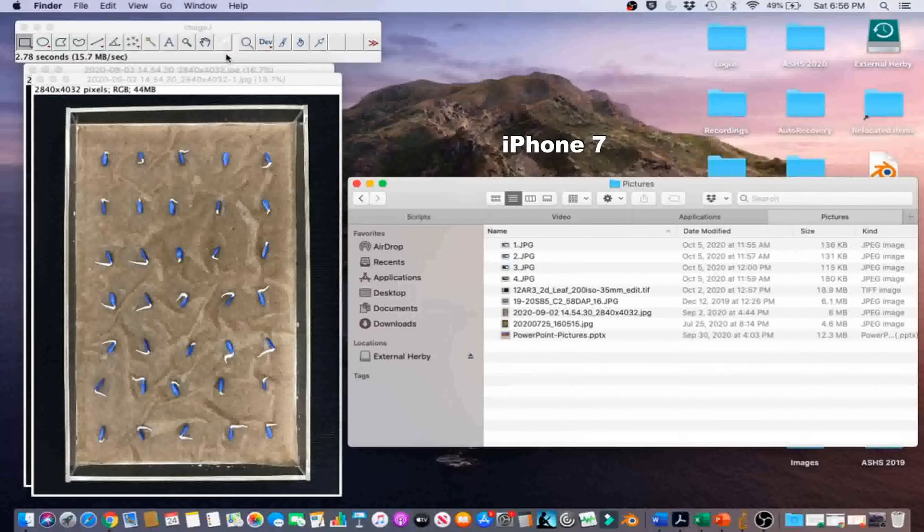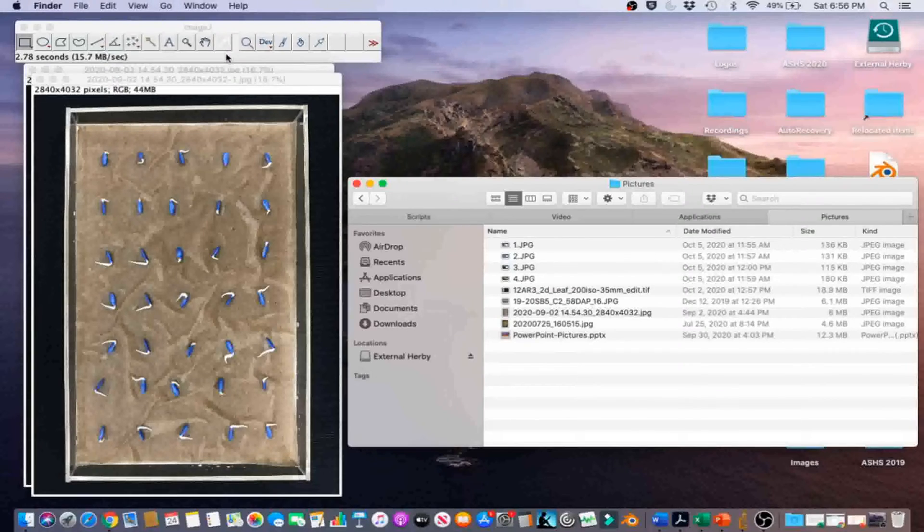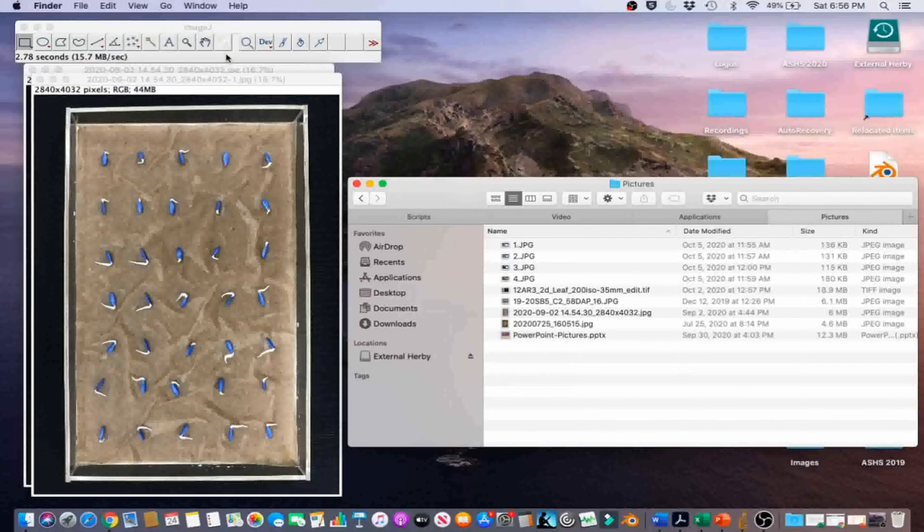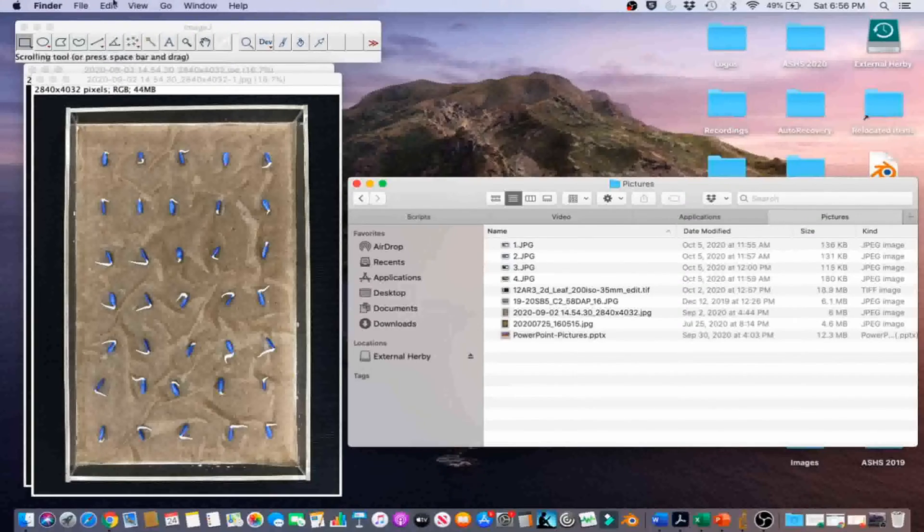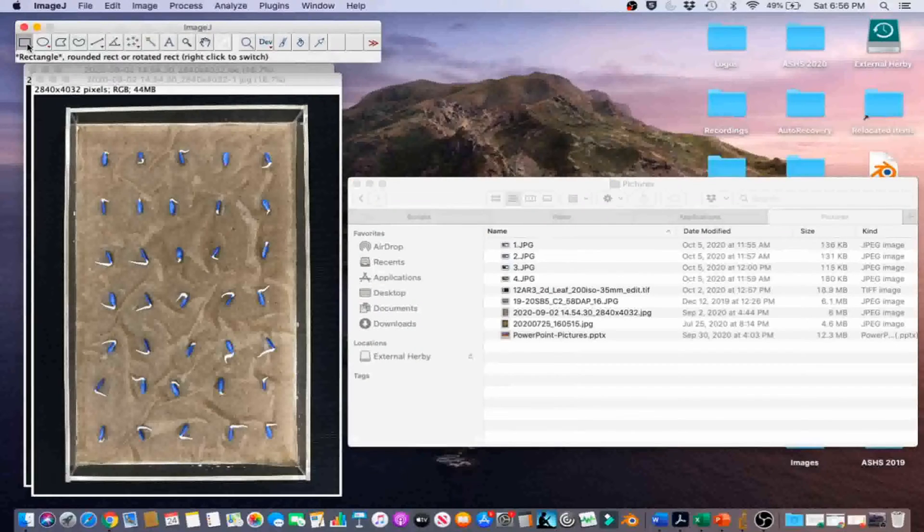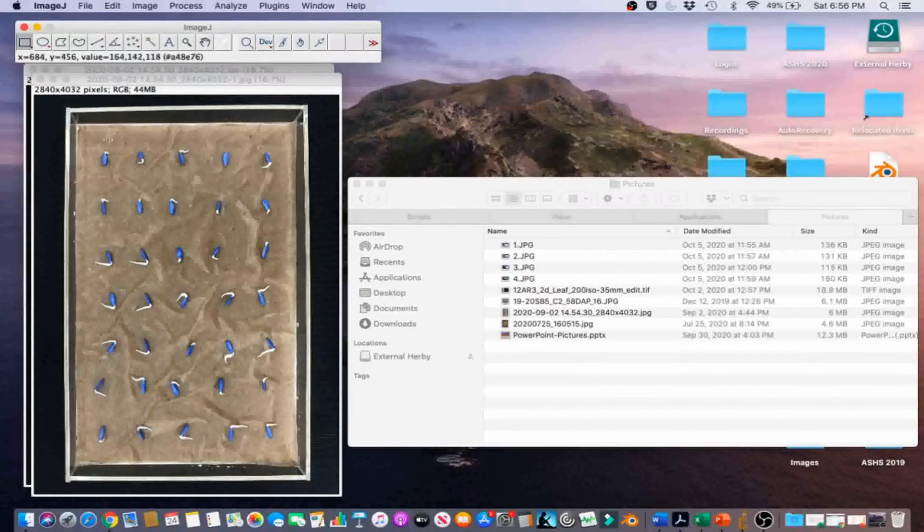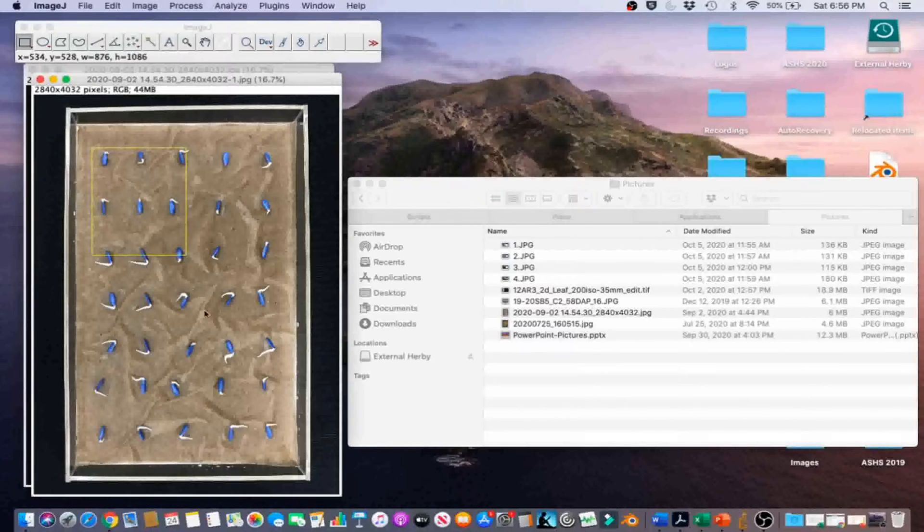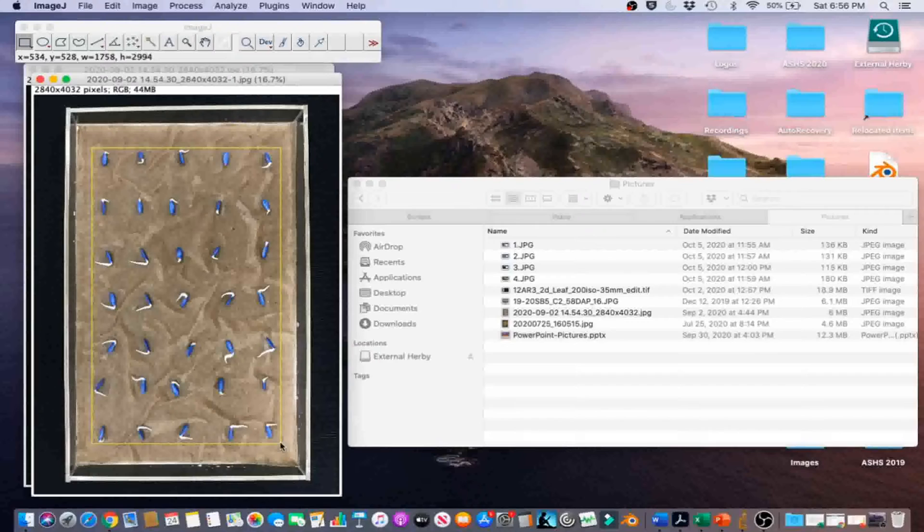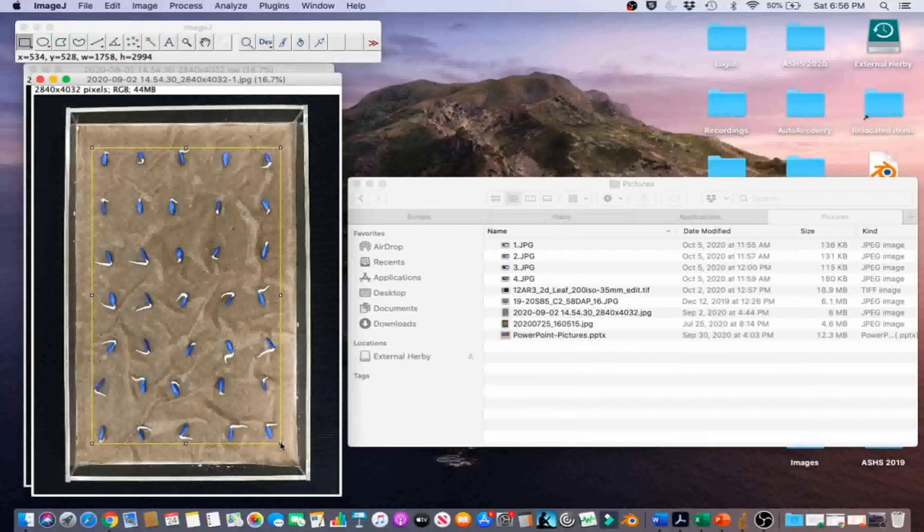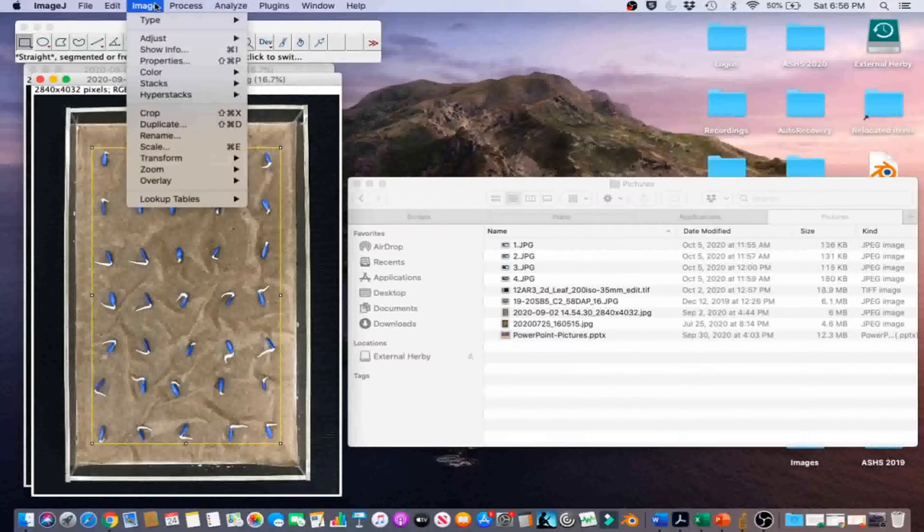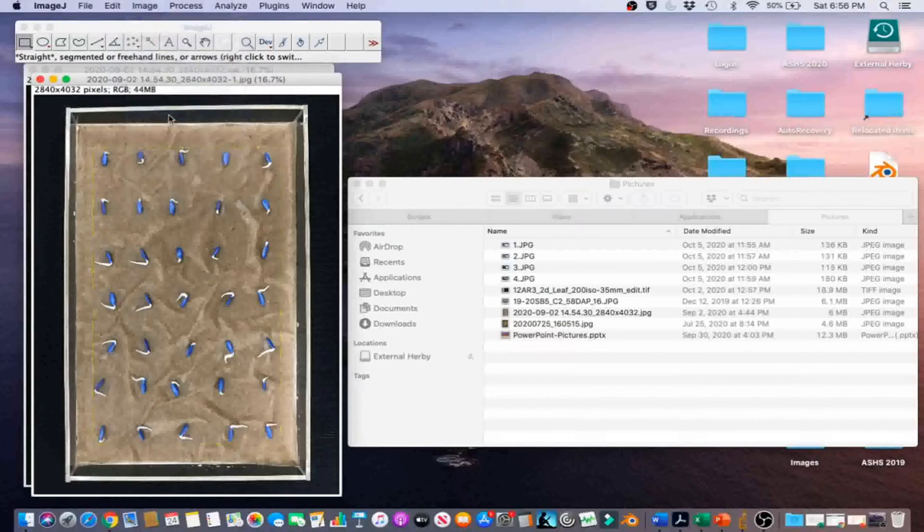In this example, we will automatically measure the number of germinated seeds by counting the number of seeds with emerged radicals using the automatic count feature in ImageJ. Click the Rectangle tool on the graphical user interface. Select the smallest rectangle possible around the seeds in the tray. Go to Image, Crop.